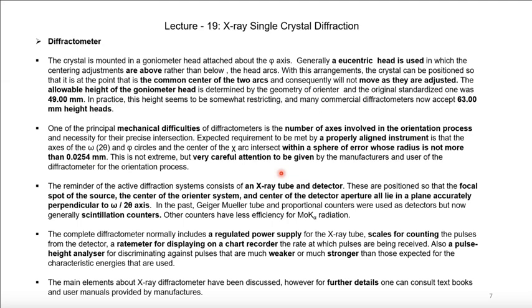Well, we always validate an instrument when we work with it. So similarly here also, a diffractometer has to be properly set up and oriented properly before we collect on the crystal. That has to be ensured properly. Otherwise, what happens? You will get wrong symmetry elements, wrong initial values, etc., and thereby all data becomes wrong, and thereby your structure determination also becomes wrong.